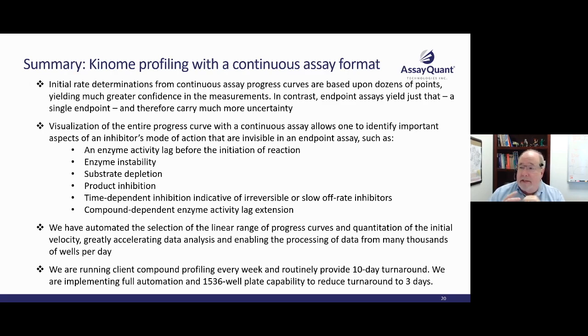But right now we're implementing full automation capability and a 1536 well plate ability, and that should allow us to reduce our turnaround time down to 3 days.